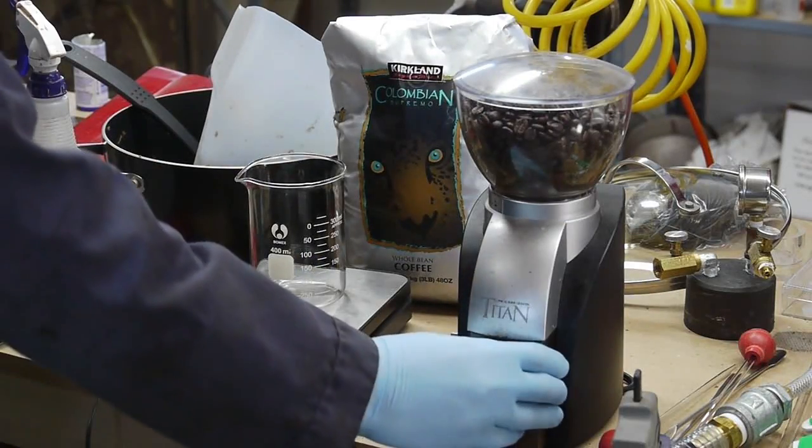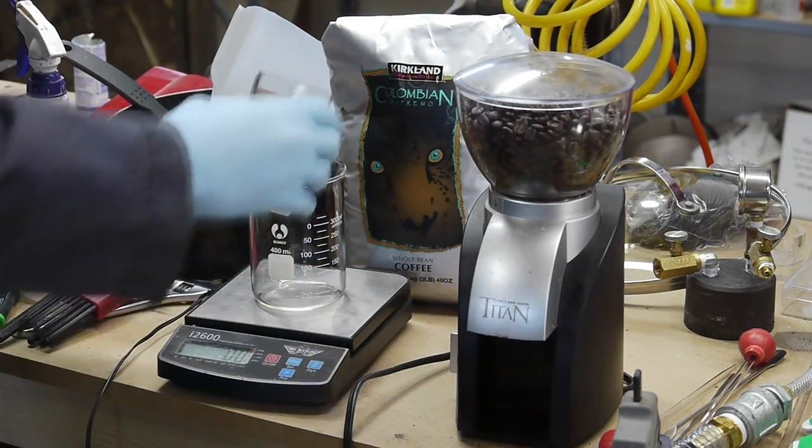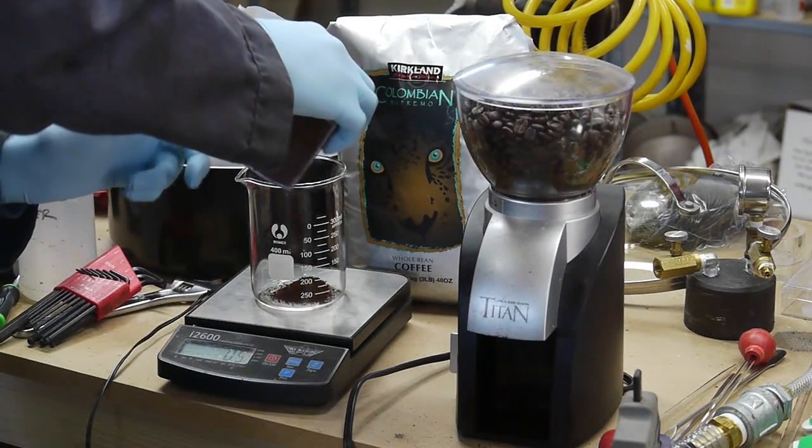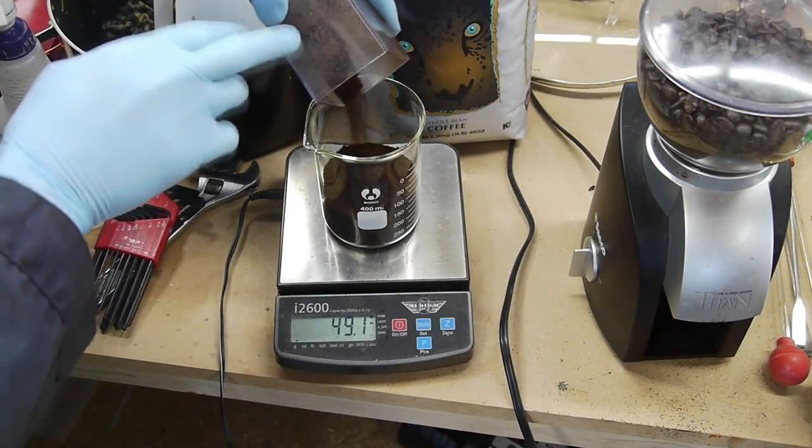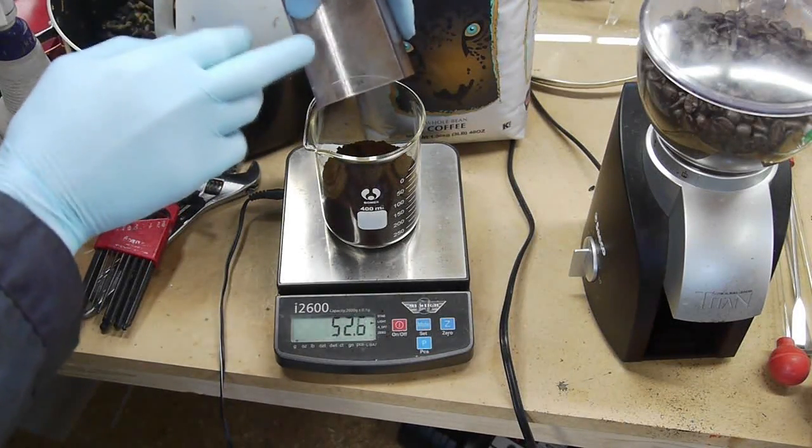So I started with about 50 grams of ground coffee - this is a medium roast Colombian - and ground it about as coarse as I would do for drip coffee, maybe a little bit finer, but not as fine as espresso grind. So it's kind of mid-range.